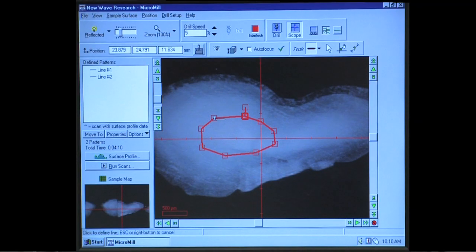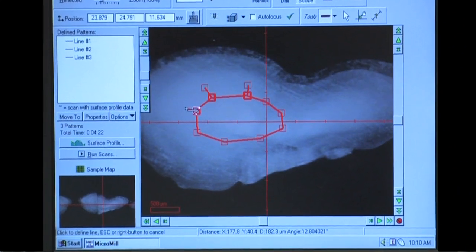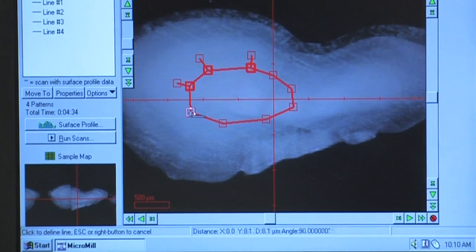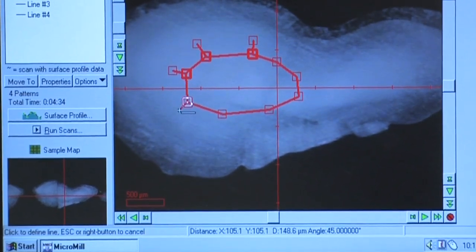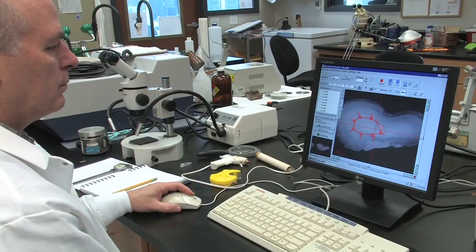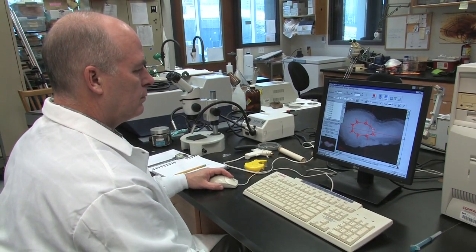From each drawing point of your first line, draw a perpendicular line equal to the radius of the drill bit along your sample line. If using the 003 bit, this line will be approximately 180 micrometers long. There is a window in the bottom of the screen that shows measurements. Follow the D measurements indicator when drawing your lines. It won't always be 180 microns, but try to get as close to 180 microns as possible.